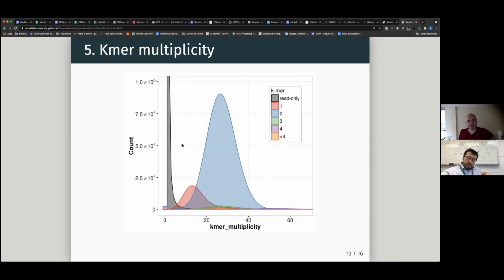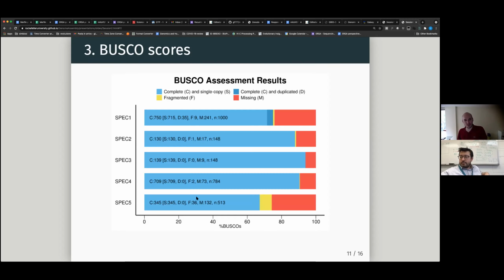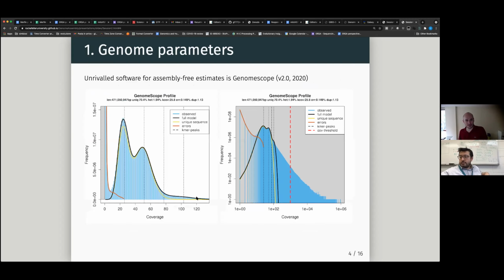Okay, this is a plot that is similar to the GenomeScope plot that we discussed extensively. Here, we took the GenomeScope plot where you don't see the difference between the curves, and you don't understand that there are multiple things piling up on top of each other. They're stacked on top of each other, and therefore they contribute to the final curve. There is something here about the error that is suggestive, but you don't actually see what's going on.